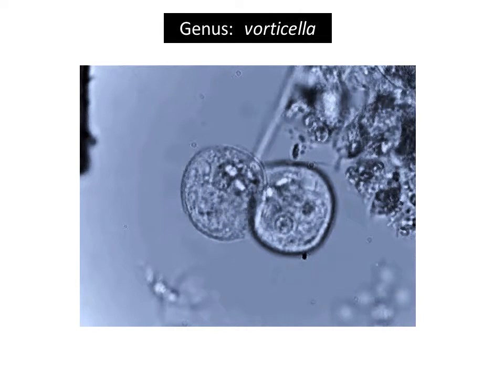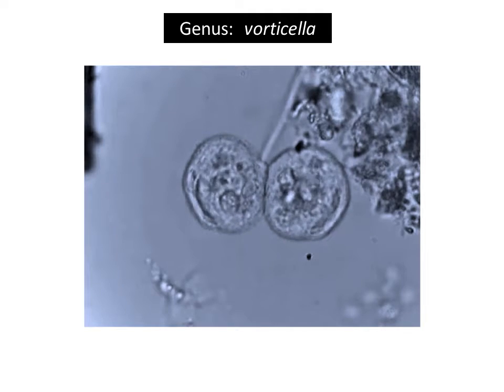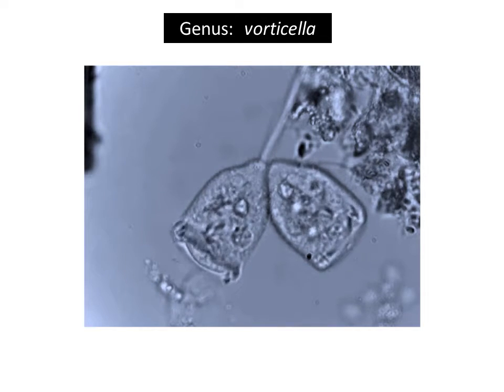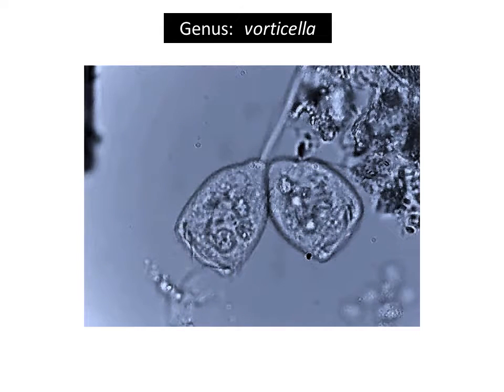At first, the parent cell and the daughter cell maintain a remarkable degree of morphologic symmetry in their maturation. Note here the distinct equality of the nuclei of the two product cells. These two side-by-side cells now lengthen, taking on the bell-like outline of the typical mature vorticella cell body. Note the continued appearance of a remarkable degree of symmetry.